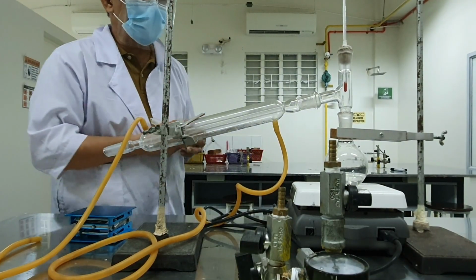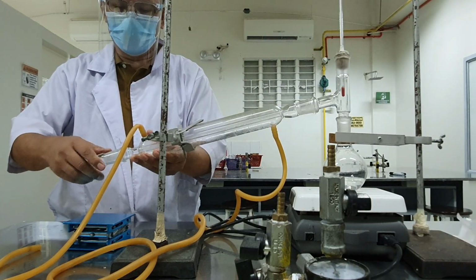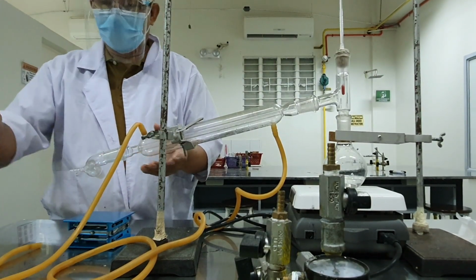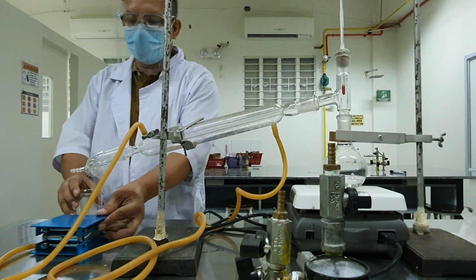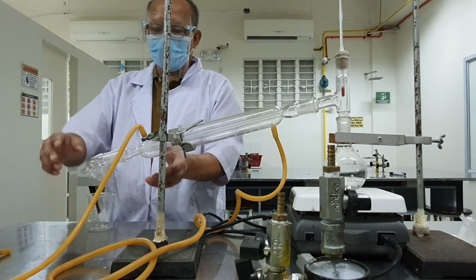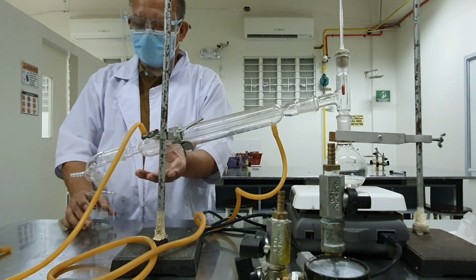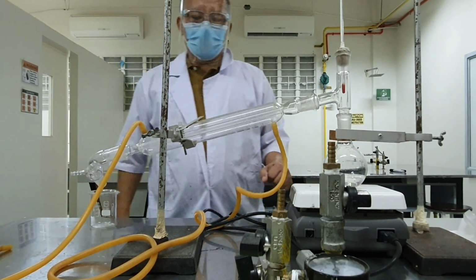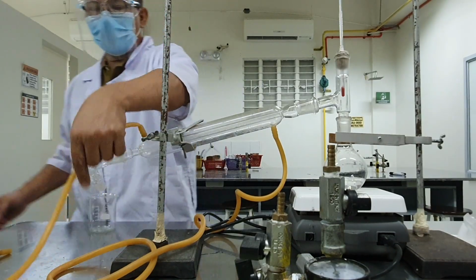So we have to lubricate this one again. Well, it's very low, so we don't need this platform. So I think that's okay now. Let's turn this one a little bit. And then, before we start, we're going to add the water.